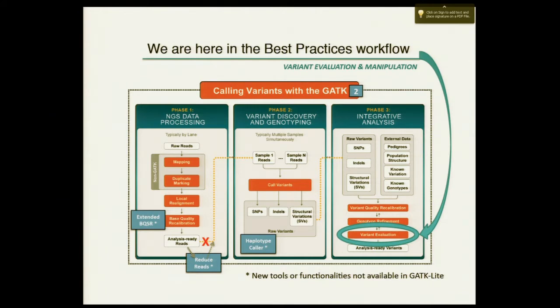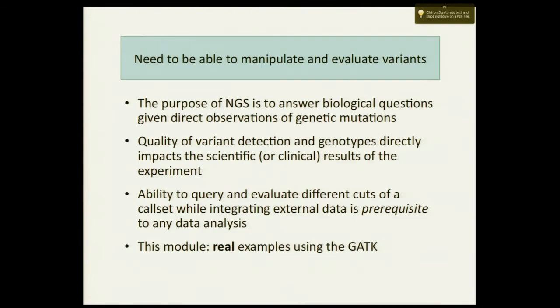This is a large field, but the general way I tend to think about VCFs is as a big matrix, where the rows are the particular sites of the genome, the particular variants, and the columns are samples. What you want to do is operate over this VCF by either subsetting sites, subsetting samples, or aggregating information in either direction or in both directions at the same time. The tools we use are combine variants, where you're trying to add rows or columns, select variants, where you're trying to select out columns or rows, and variant eval, where you're aggregating information across this whole big matrix.